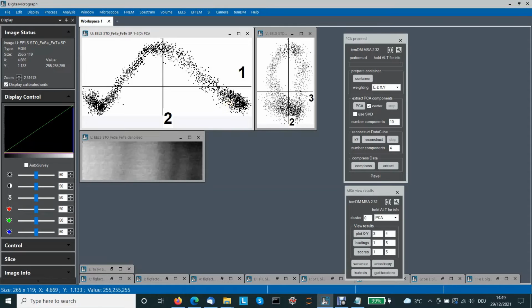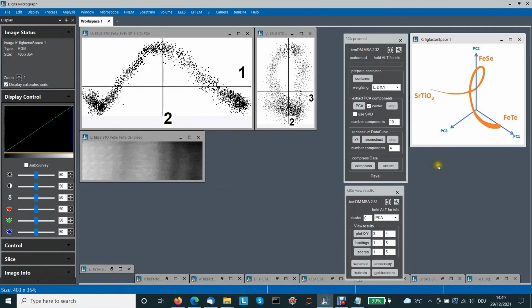Well, we are now in a space of 3 dimensions, and we can clearly visualize what's happening in these 3 dimensions. I tried to make a simple plot of 3 dimensions, and what we see from these scatter plots is that in the plane formed by the first and second component, our data variation is some kind of arc.